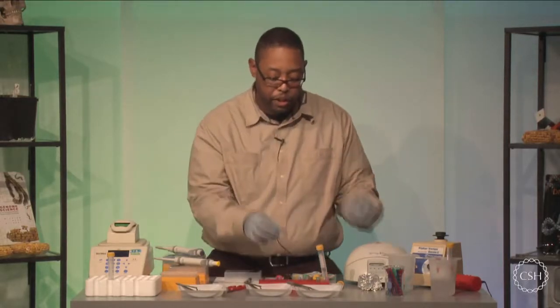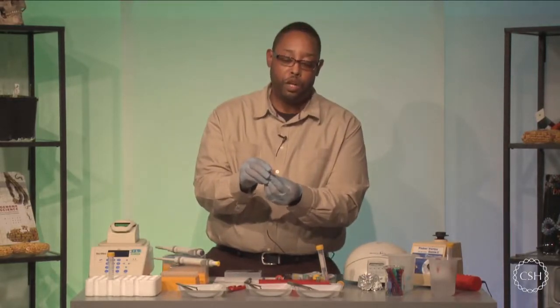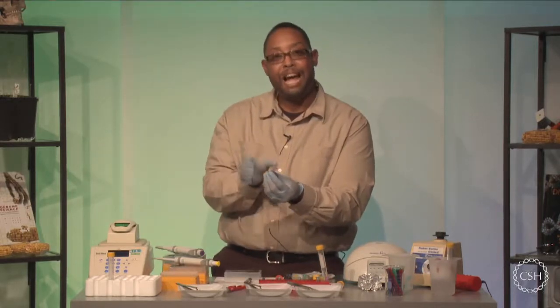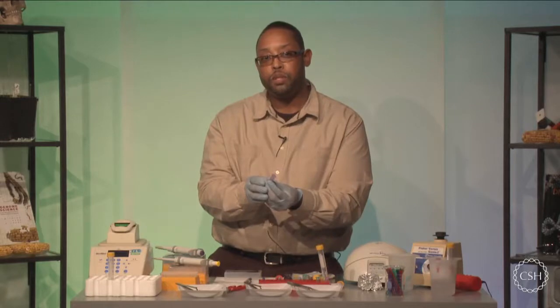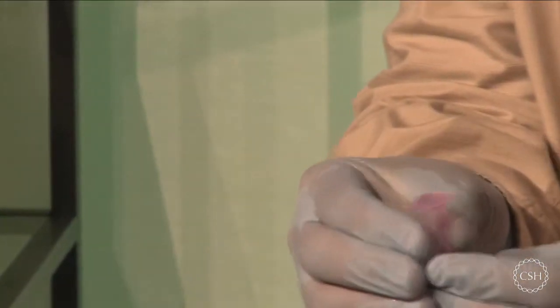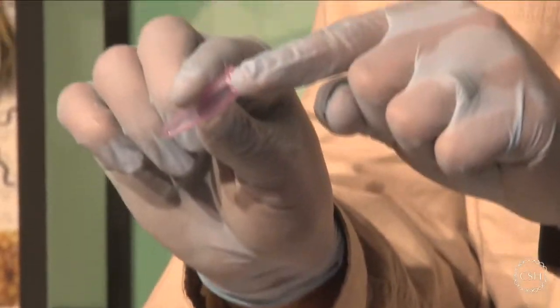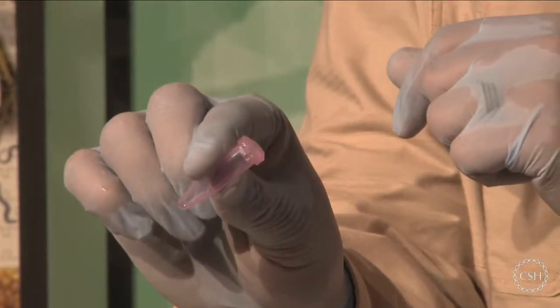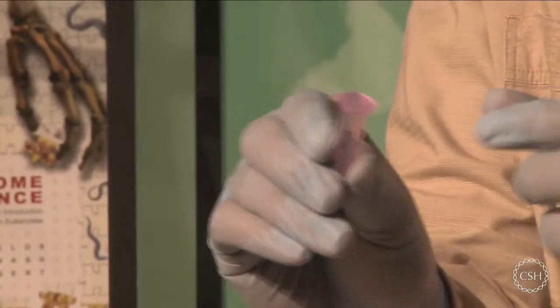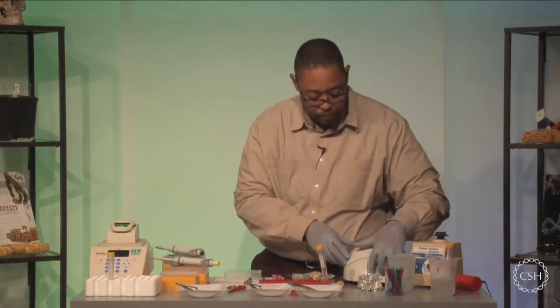tube. But one thing that I mentioned a little bit earlier is that your test tube has a hinge on the very top of it. And you're going to want to make sure that your hinge is facing out towards you so that you can see that the pellet is underneath that area of the test tube. So it's going to be very important that you physically see that. So please make sure that you're facing that hinge right at the bottom of your test tube. Okay, so these hinges are facing outward towards us so that we can find our silica pellet right underneath it.